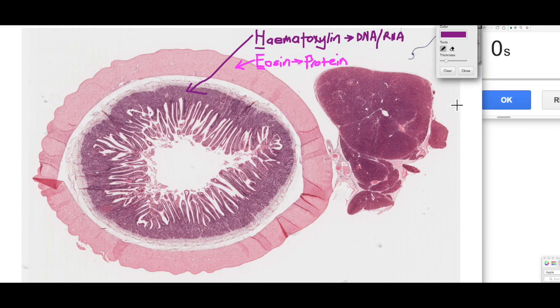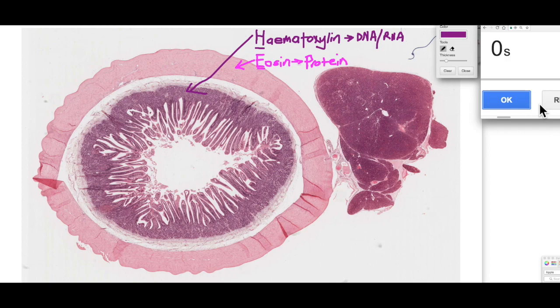So just by looking at these different stains, we can actually begin to interpret a little bit about the structure and makeup of the tissues present on this slide. Anyway, that's a little bit of an introduction to staining. I hope you found that useful.